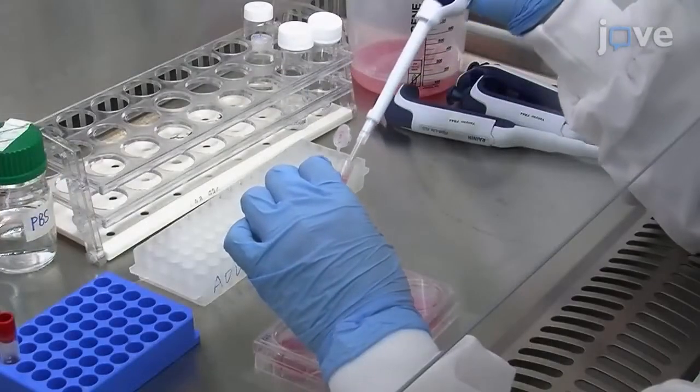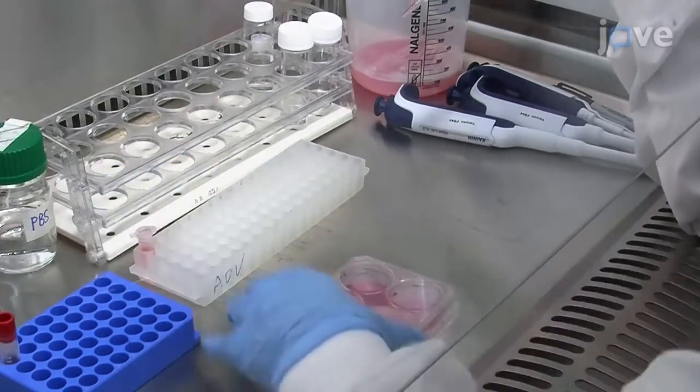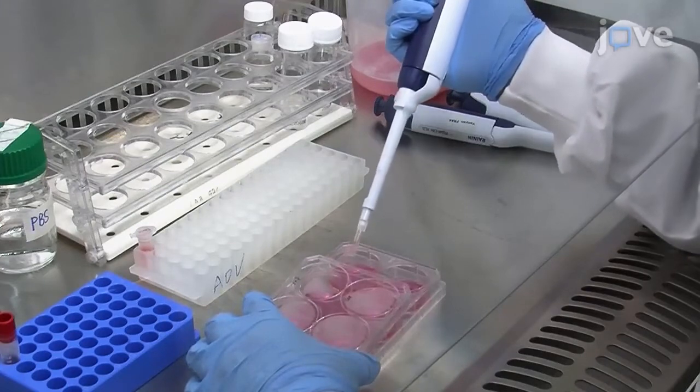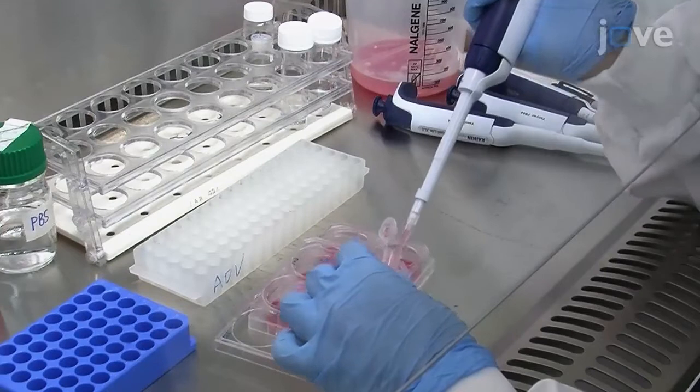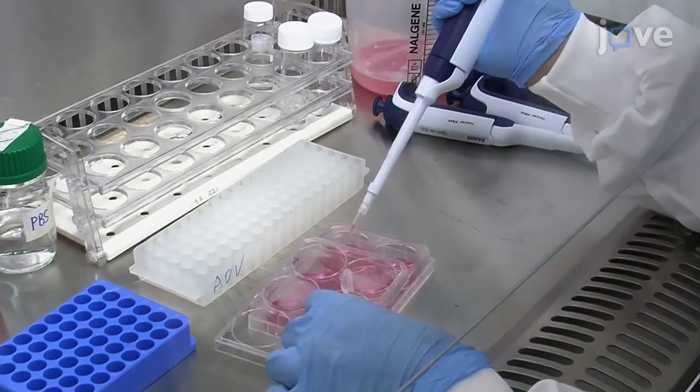12 hours post-transfection, dilute the HVT virus stock with M199 culture medium to a concentration of 100,000 plaque forming units per milliliter. Add 130 microliters of the diluted virus to each well of transfected cells. Set one well of untransfected cells.